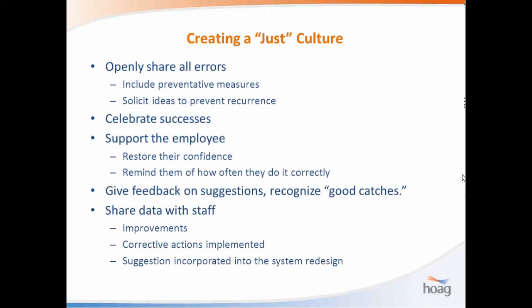Give feedback. Every time an employee makes a suggestion, there's a field in OTIS for suggestions, it's important to give them feedback, even if you're not going to implement it. Sometimes people add things to their own system, a little extra safety check that may not be part of the SOP, and we'll share that with staff. Well, so-and-so has done this to make it less likely for them to make an error in this incident. So we do share that, and we definitely give feedback anytime someone makes a suggestion. And then just recognize them for catching something and reporting it in the system.